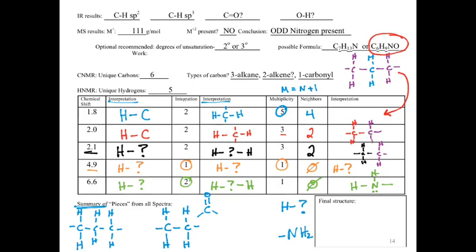Now I've got that cleaned up. If we go back through and count, we've got 1, 2, 3, 4, 5, 6 carbons, which sounds good. One oxygen also sounds good. As far as our hydrogens go, we've got 2, 4, 6, 8, 10, 12, 13 hydrogens. We've got another issue here. Our formula says only 9 hydrogens, so 13 hydrogens is way too much. So what does that mean? Don't panic. We are going to assume that we did everything correctly so far and that we've got duplication again.